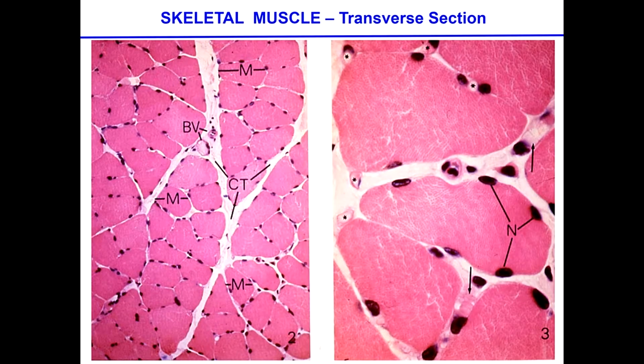We look at the skeletal muscle in a transversal section at different levels of magnification, and in any case, we see the nuclei are always in the periphery, okay? Nuclei in the periphery, in every case. And what we find now is the connective tissue that appears in white.